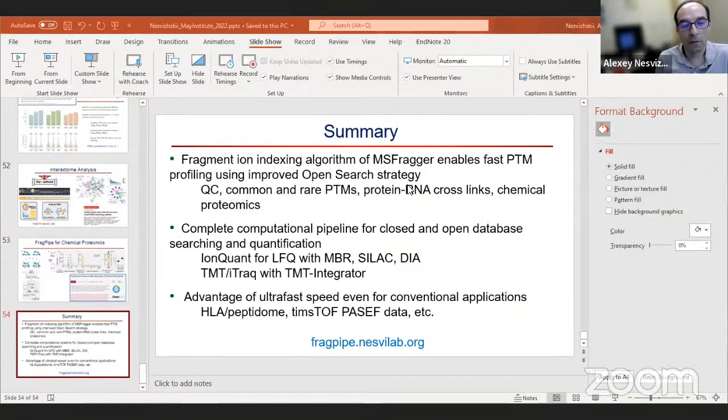So I think you need to decide what's more important for you: the accuracy of quantification or the number of IDs. In our facility, for example, we mostly do MS3 based because we don't care how many proteins you quantify. We want more accurate fold change, reflective of the biology. But a lot of times, you just want to differentiate between changing and not changing, and an MS2 workflow is just fine, and you get more IDs.